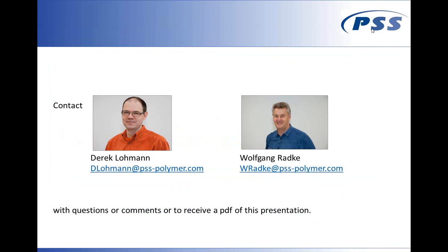The invisible component will elute very close to your solvent molecules. In that particular case, small pore sizes would be attractive because you get a very good separation between the visible polymer and the solvent region where your invisible polymer should elute. So again, you have to think about these facts as well.